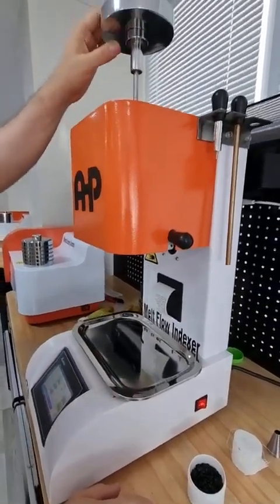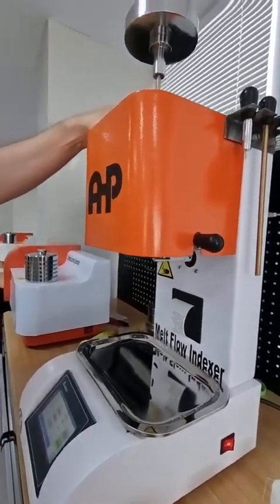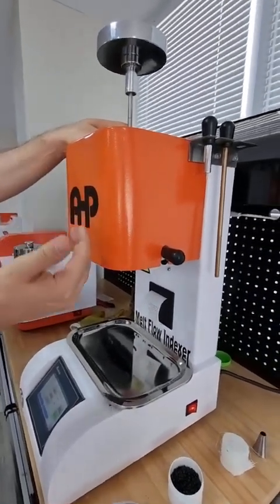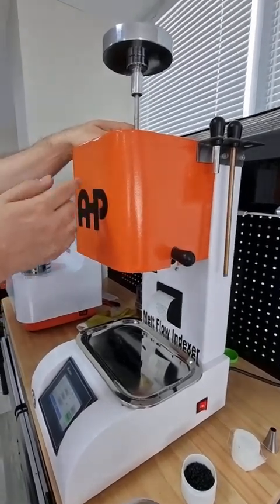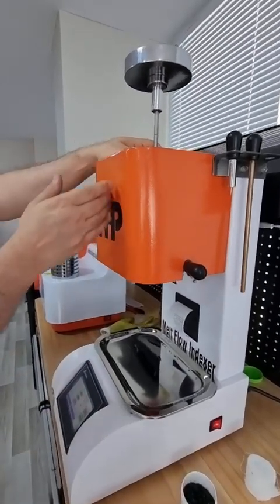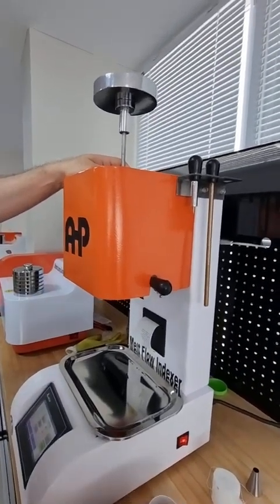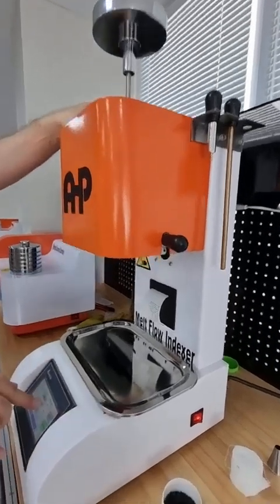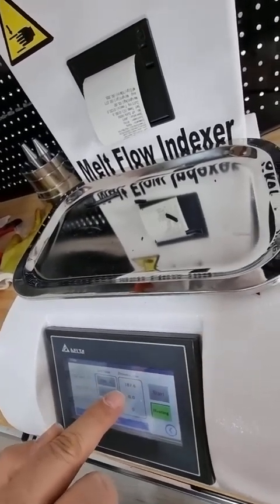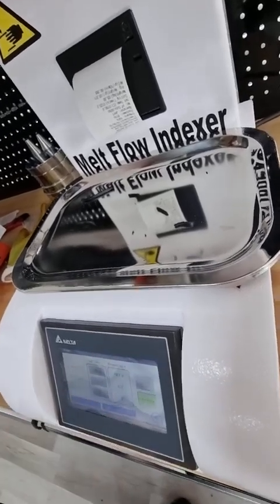Wait at least four minutes for the material to be homogenized in temperature, then start the test with 5 kg — this is polyethylene. When filling material into the cylinder, the temperature will drop one or two degrees because the material is at room temperature while the cylinder is set to 190°C. Here it shows 187.7°C, so wait for the temperature to stabilize back to 190°C.